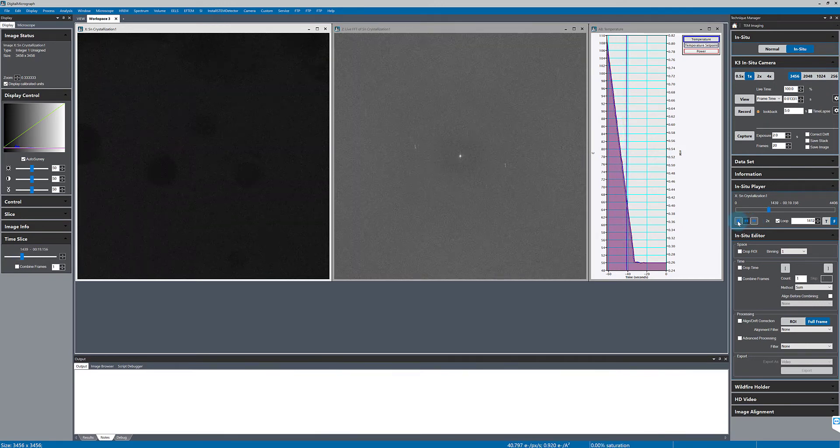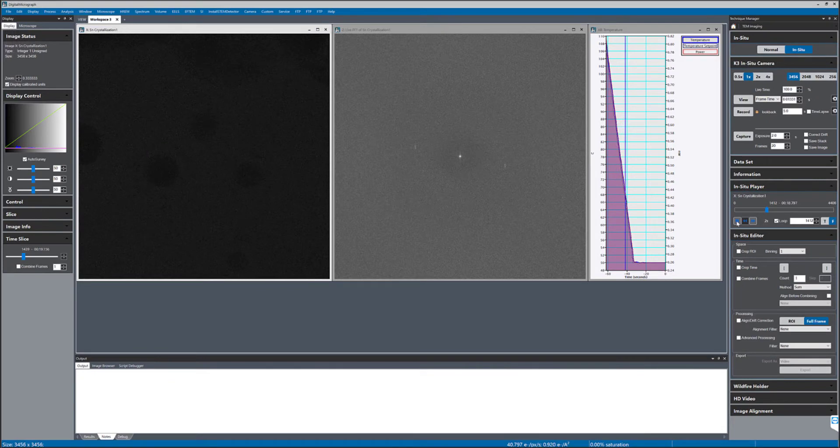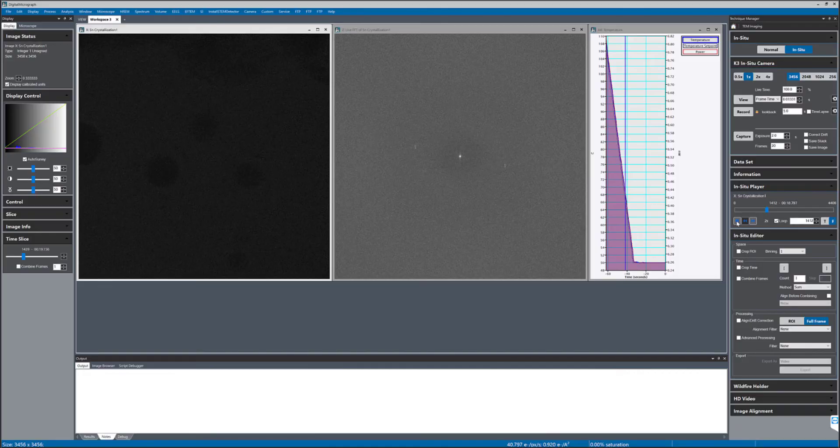And right there, I can see a distinct onset of that spot in the FFT when the tin crystallizes.